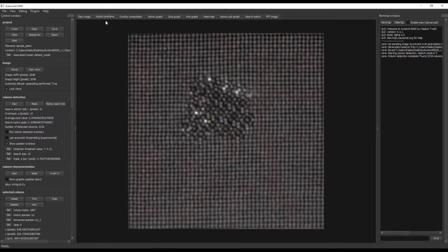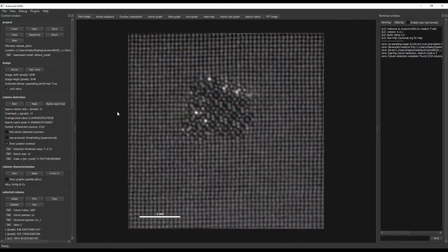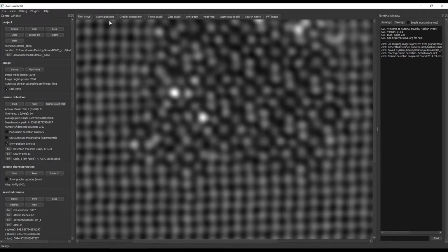And you can go back and forth with the tabs with Z and X, which I find useful often. And you can also not have them locked. So when it's locked, then if I change the position here, it should be changed here as well.